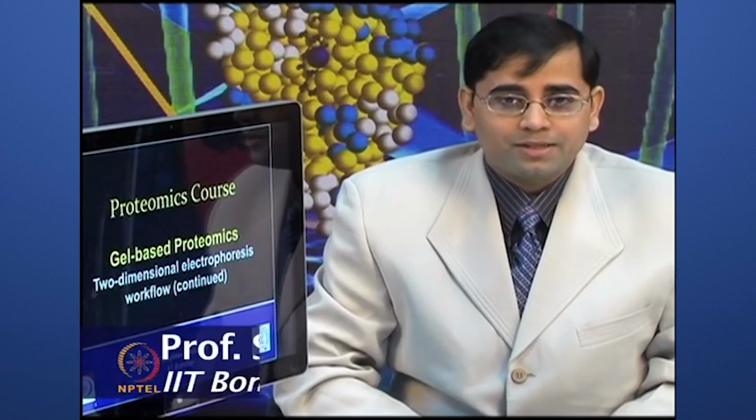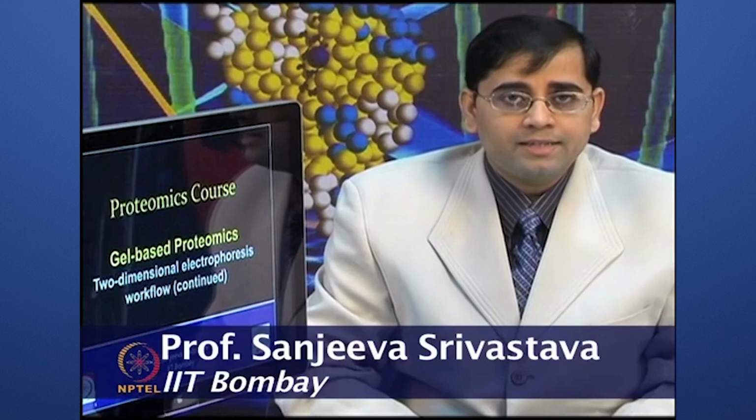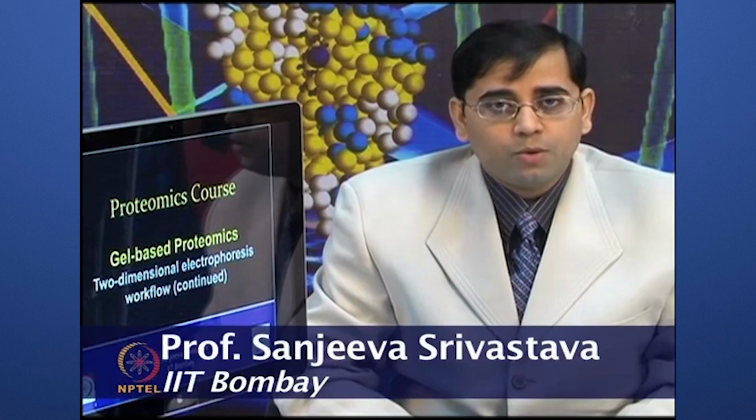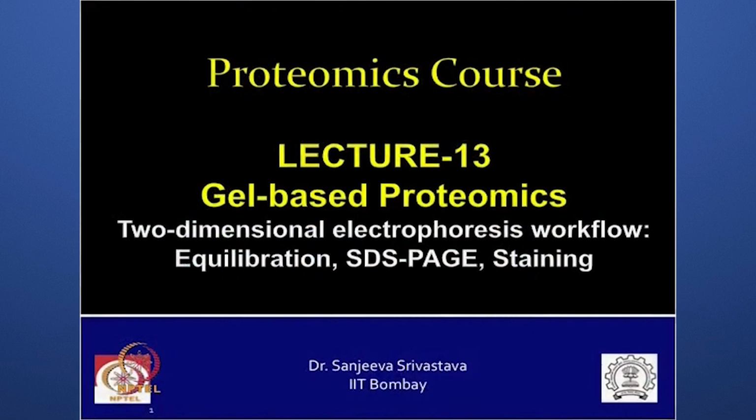Welcome to the Proteomics course. In the previous lecture, we started discussing gel based proteomics. In that workflow, we talked about two-dimensional gel electrophoresis, and the different steps involved in performing it.